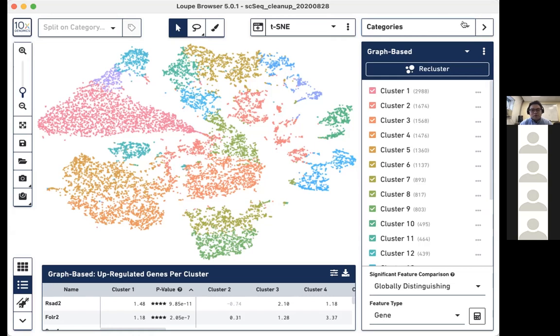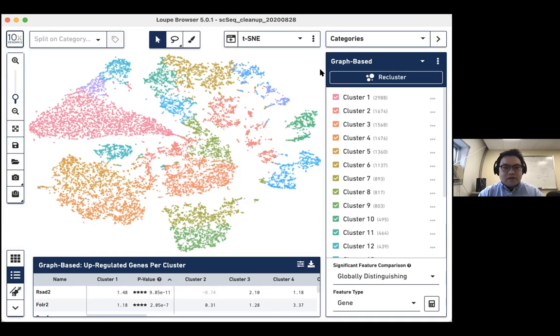They have several tutorials to help you figure it out. But here I will put more attention on further analysis with Seurat and the Bioconductor packages. We will describe more details in the next two sections.